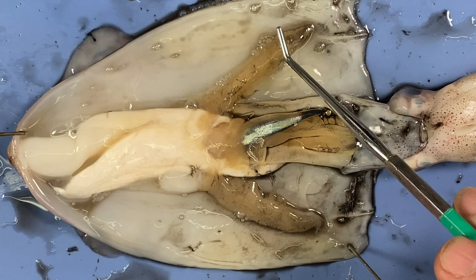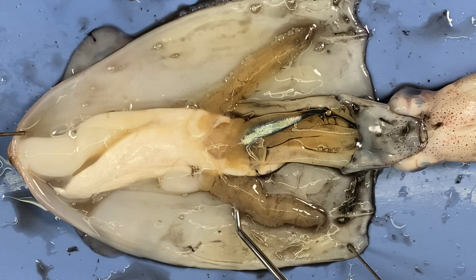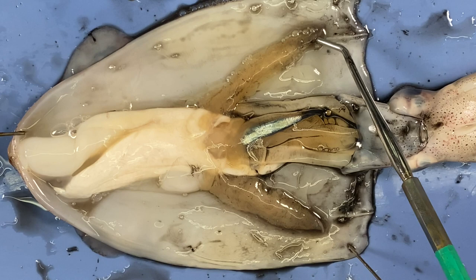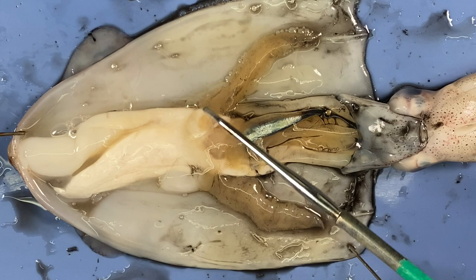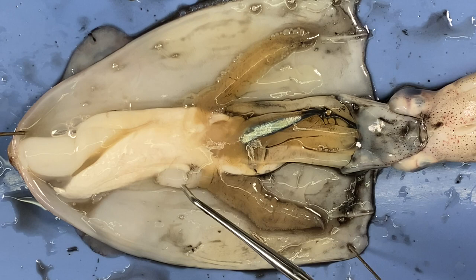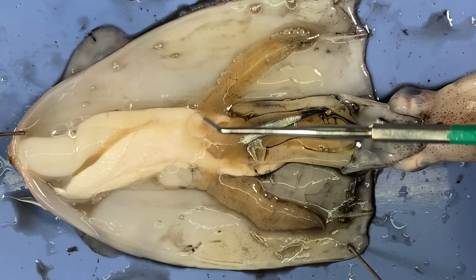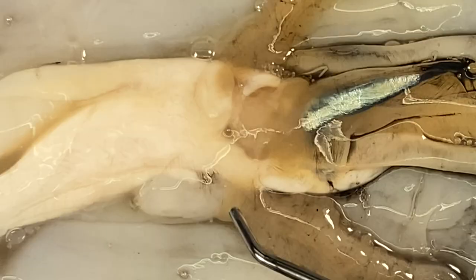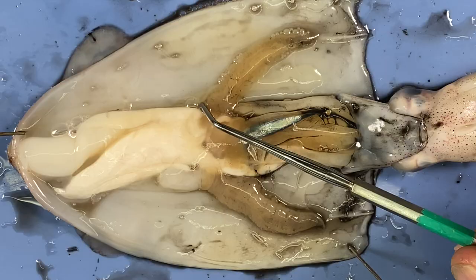Along the gill there's a thin white line — that would be a branchial vessel. They have a closed circulatory system: blood stays within vessels and needs to go to the gills, where deoxygenated blood absorbs oxygen from the seawater, then circulates the rest of the body. At the base of the gills there are two branchial hearts. I can't easily see them here, but they're generally at the base of the gills — one just there and one just there — pumping blood along the branchial vessel to the gills.